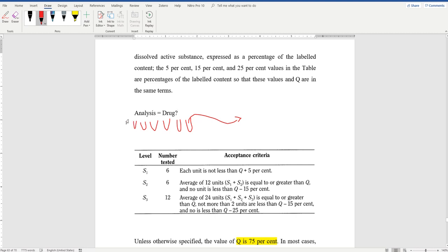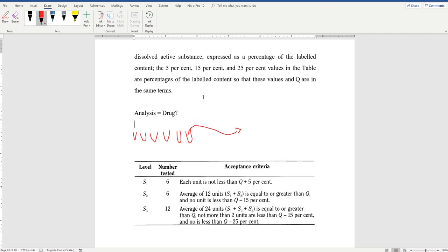Let's say here I have a certain amount of drug. So I have 6 readings. Tablet number 1 has a certain amount of drug. From that, let's say in the first one there is 1 milligram, and that 1 milligram was in 5 ml, right? When you analyze the first one, according to the analysis, there is 1 milligram of drug dissolved here. But this is in 5 ml.